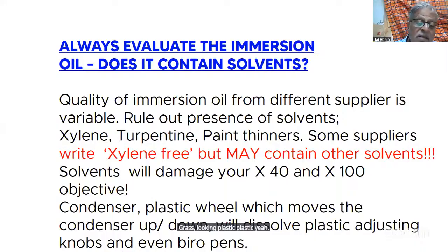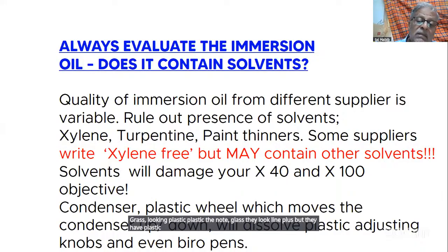They are not glass. They look like glass, but they are plastic. And if you put any kind of solvent on it, it will go cloudy.